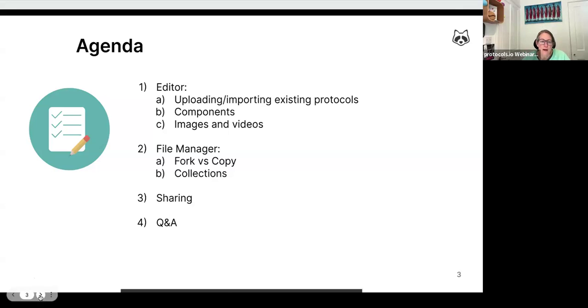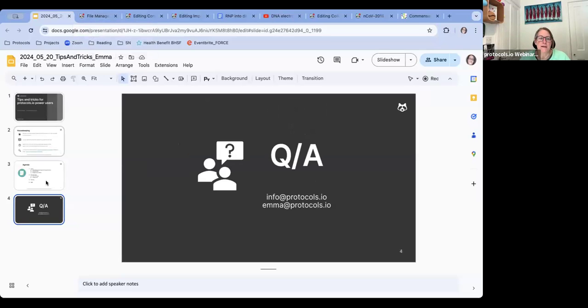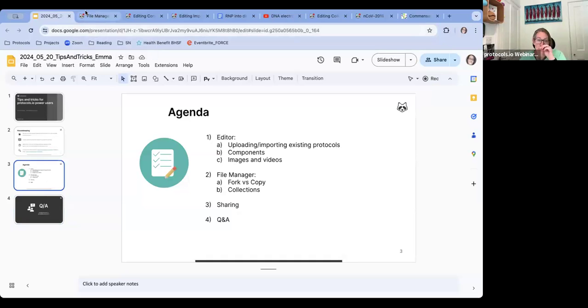We may not take the whole hour, but we'll see how we go on. And then it will be just Q&A. So literally that's all the slides that I have. So we'll get started. I'm going to put this up so I remind myself as I go through.